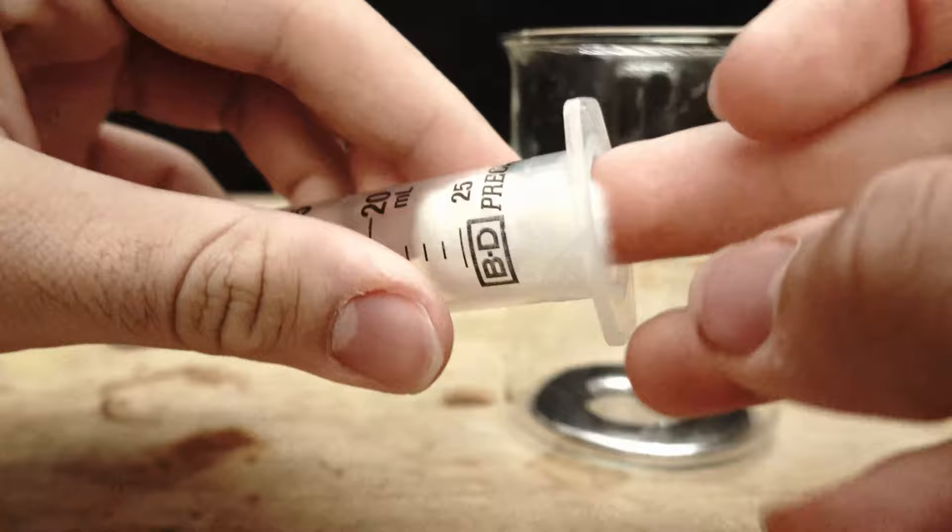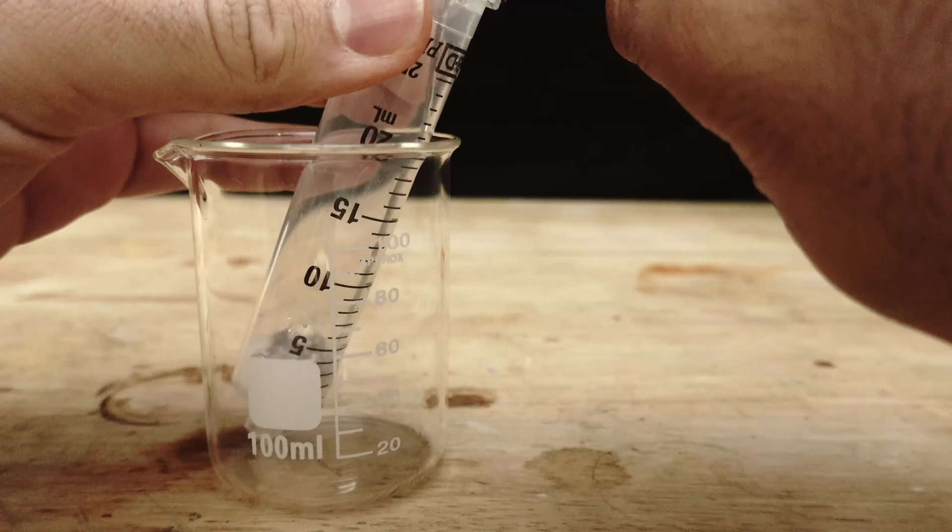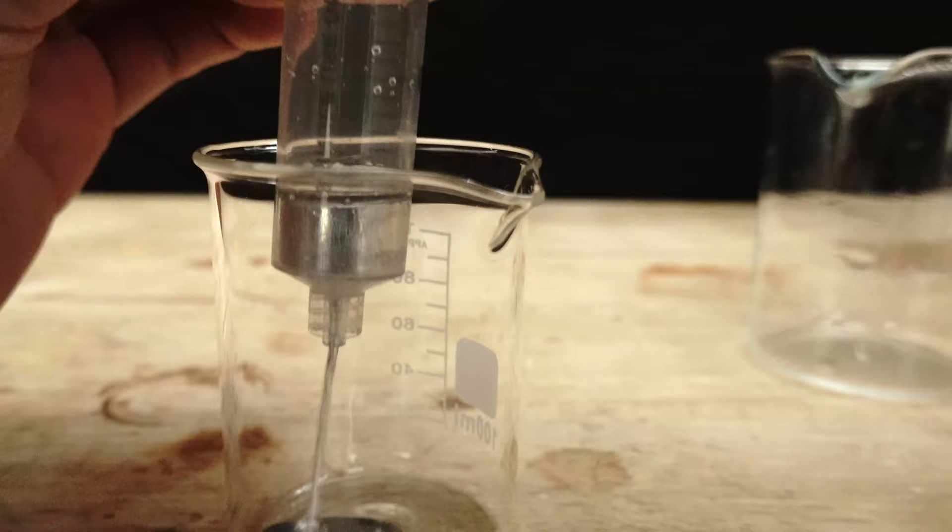Now the final step to our purification process is to force the mercury through a syringe. Not just any syringe though, in this syringe we shove a cotton ball to act as both a towel and a filter. By pouring the mercury into our makeshift filter and pressing down on the plunger, all large impurities are left behind and all the water is sapped away by the cotton. The definition of two birds with one stone.